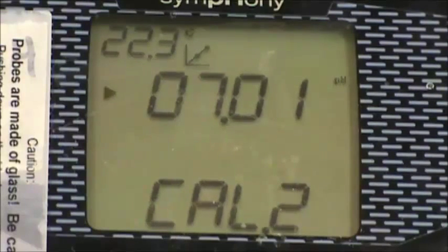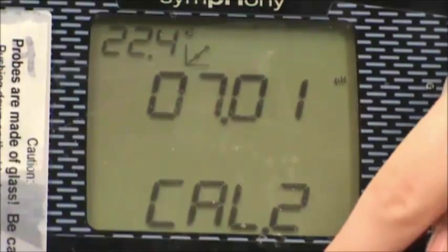Again, you will know the value has stabilized when the pH icon to the right of the reading stops flashing. Press the measure button to save the values for your two calibration points.